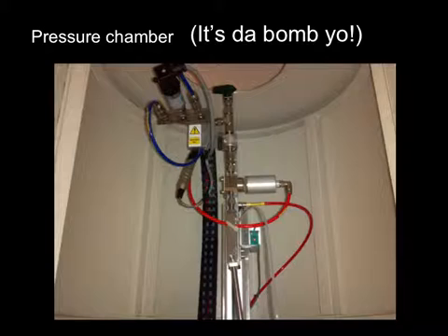Up here, you load your solvent in here. Close this valve here, and your solvent gets pressurized up here to this superheated condition where it's about 200 degrees Celsius and 10 bars, or about 10 times atmospheric pressure. So this is under quite high pressure and temperature.